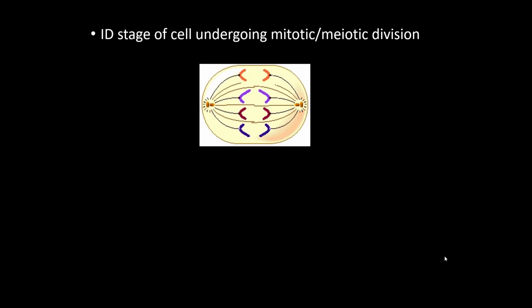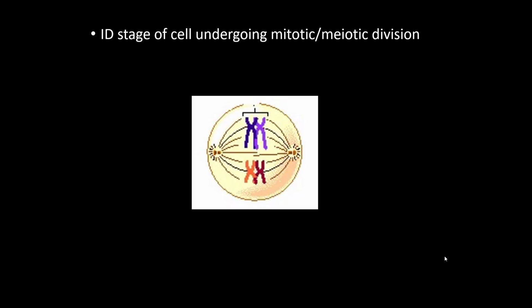So anaphase of mitosis. In this picture, though, we have something called tetrads. When they come together and are combined, where there are 4 chromosomes lined up together, this is going to be tetrads, and this is only found in meiosis 1. Since they're lined up in the middle of the cell, this is metaphase, and so this is metaphase of meiosis 1.